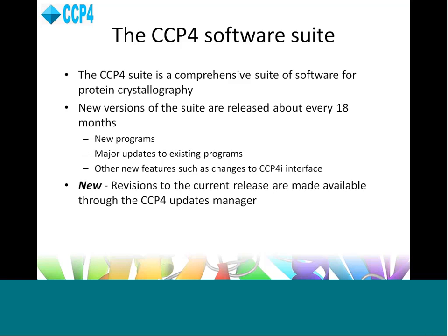And just very recently we've had a new feature made available where revisions to current releases can now be installed via a package we've developed called the CCP4 Updates Manager, which allows any user to get access instantly to the latest software. And I'll show you a bit more about that a little later on.